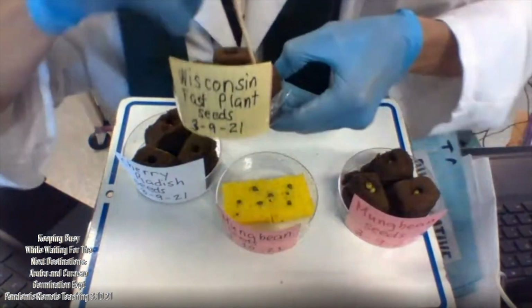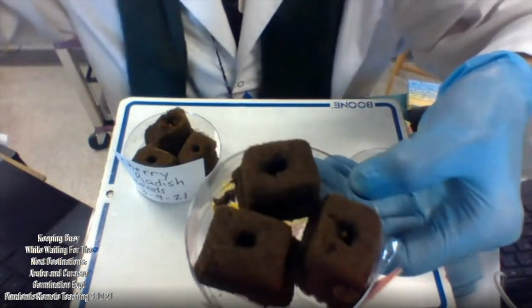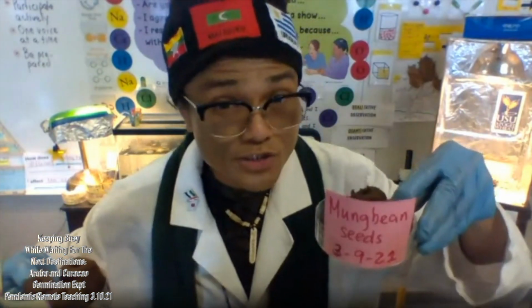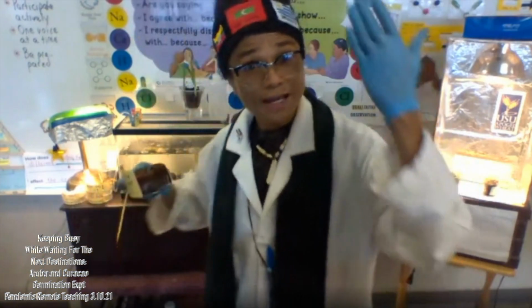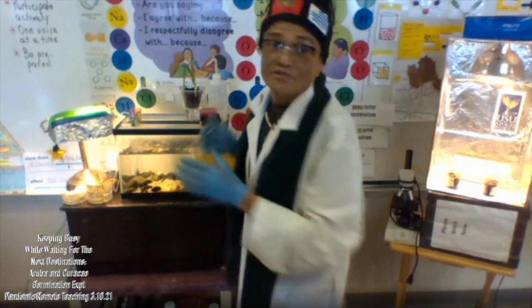Okay, hold on. Oh, it's down deep there. All right, I'm not going to disturb the young seedlings, but we saw the difference, particularly the mung bean. So I encourage you to select the mung bean. I have lots of mung beans in the office because they're fascinating to see as they grow faster when the moisture or water is provided.